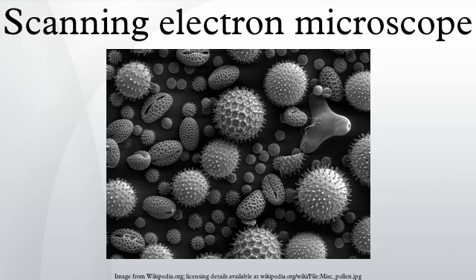When all parts of the detector are used to collect electrons symmetrically about the beam, atomic number contrast is produced. However, strong topographic contrast is produced by collecting backscattered electrons from one side above the specimen using an asymmetrical, directional BSE detector. The resulting contrast appears as illumination of the topography from that side. Semiconductor detectors can be made in radial segments that can be switched in or out to control the type of contrast produced and its directionality. Backscattered electrons can also be used to form an electron backscatter diffraction image that can be used to determine the crystallographic structure of the specimen.